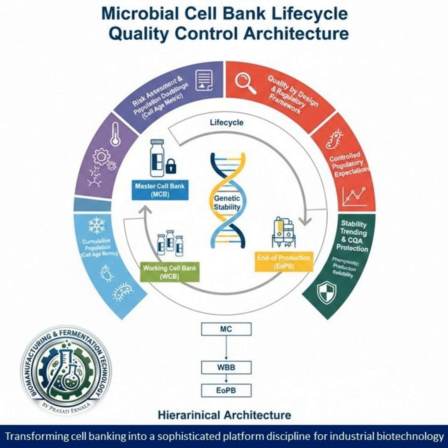What about gram-positives? I'd assume their thicker cell walls make them tougher. They often have a higher tolerance to the cold itself, but their main risk is aggregation. Clumping. Oh, okay. When cells clump, you can't accurately measure your recovery, which is a key release test, and you risk seeding your reactor unevenly. So the focus shifts to including surfactants or other controls to prevent clumping.